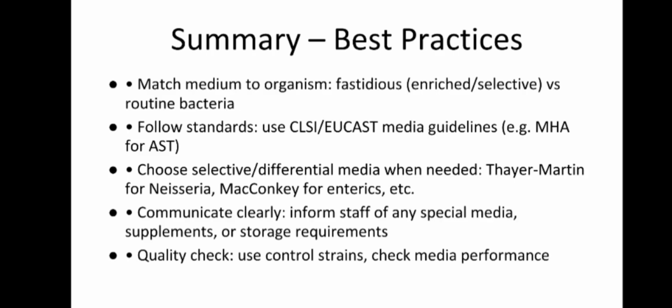And also keep in mind that we always transfer inocula in a laminar flow hood if you're working in a laboratory or college setting. But people also do it without one. In that case, they have a well-administered protocol.